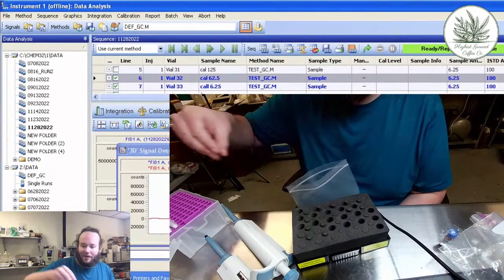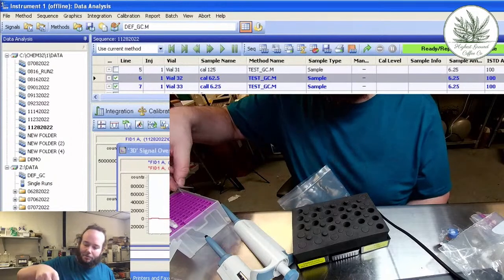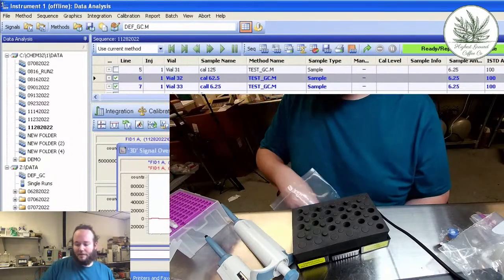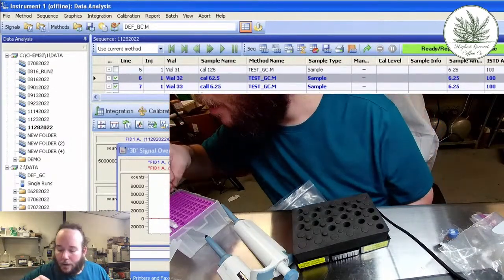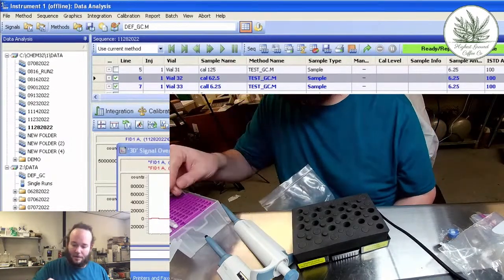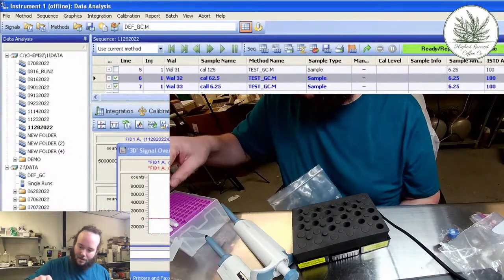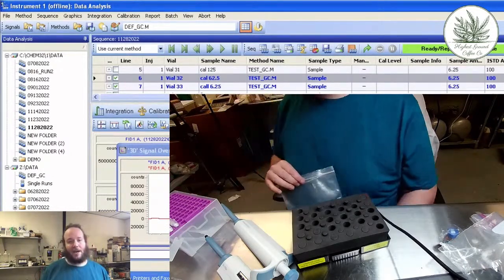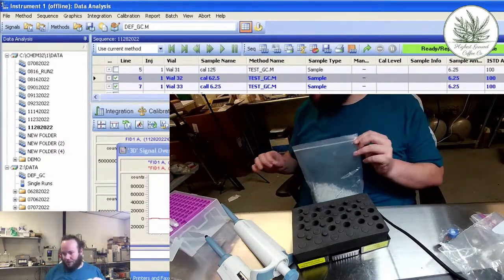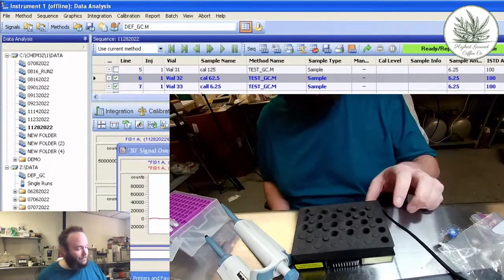Hey, Maui Queen, thanks for joining us. Wow, that actually does fit in there. That's surprising. So just a quick recap, we're going to rerun our calibration solution because it didn't run how we expected it to.